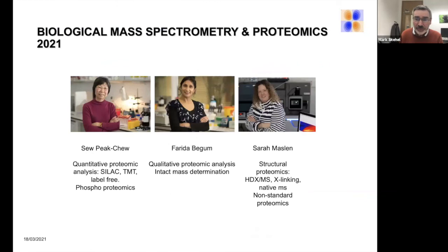Okay, so these are the guys down in the lab. This is how it is now. I'm of course leaving at the end of next month, and somebody else will be here. So this may change in terms of what the lab focuses on, because I've had a particular interest in the structural side of things. I would imagine it won't change. I imagine it will carry on. But Sue does all the TMT stuff and the quantitative side of things. Frida is qualitative and the intact mass, and Sarah is heavily focused on structural hydrogen-deuterium exchange, essentially.